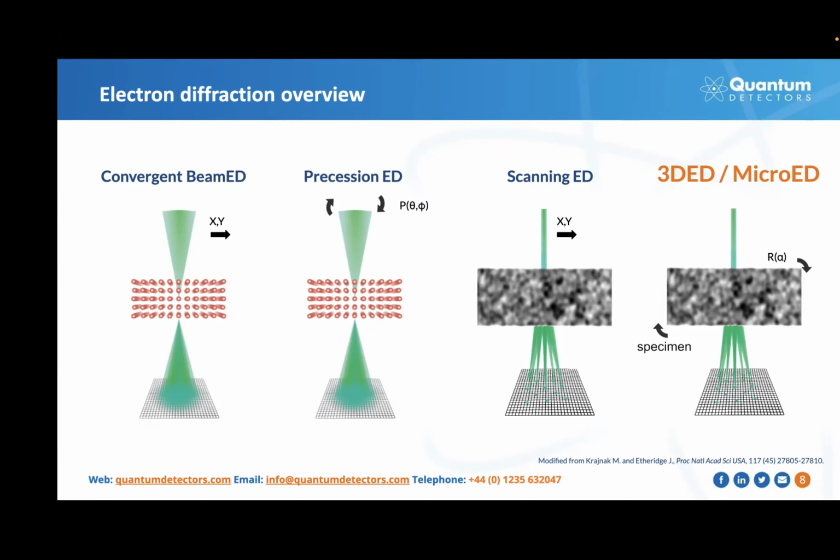In this setup, the sample is tilted, which enables collecting different diffraction patterns at several angles. This in turn allows for the 3-dimensional reconstruction of the structure of the material. For many samples, it is essential to work under very low dose conditions to prevent beam damage.